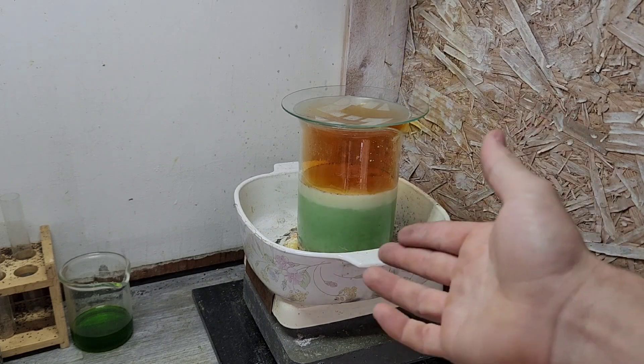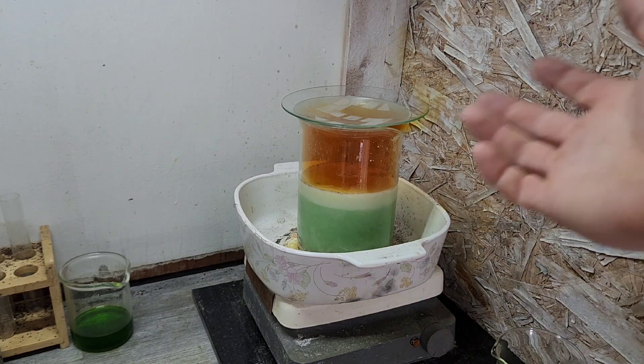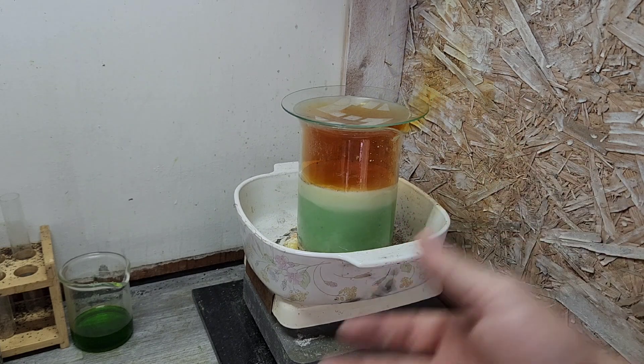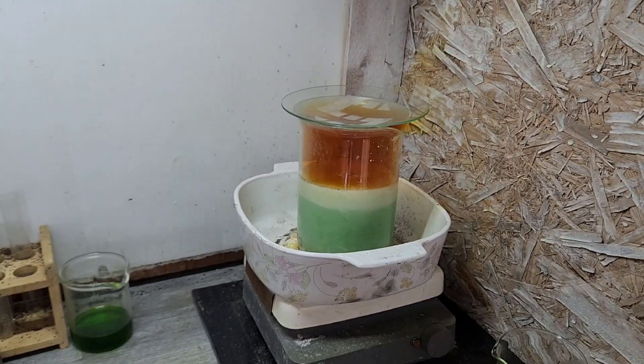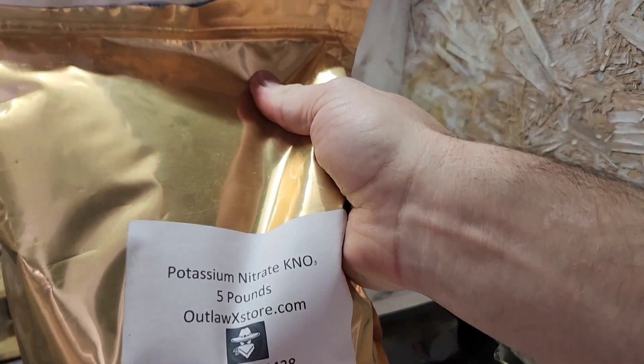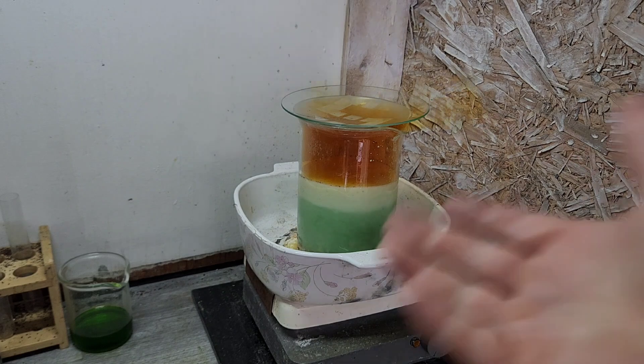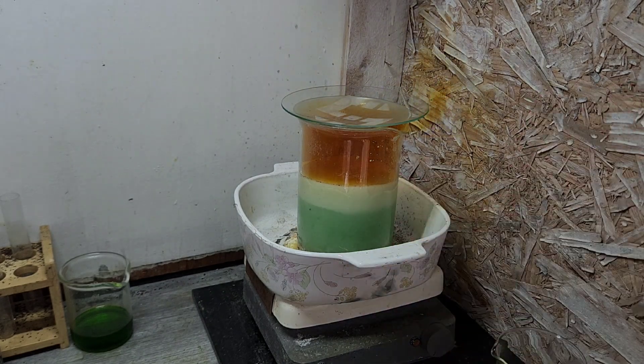Let's let that do its thing. If we need to add a little more sulfuric, we'll put more sulfuric in. Or if we need to put more potassium nitrate, we can go ahead and put that in there. We'll kind of see as we go.